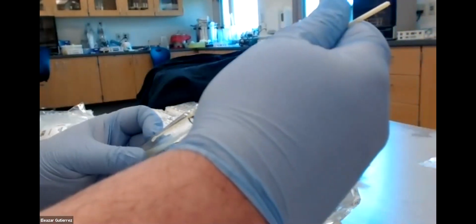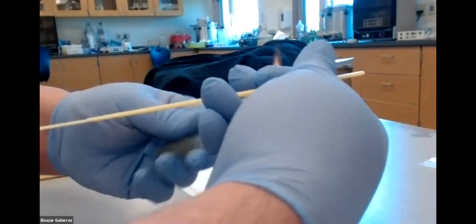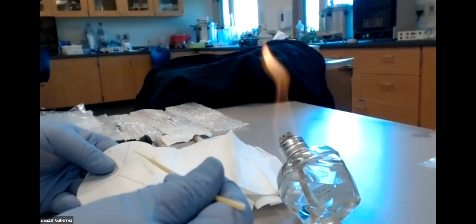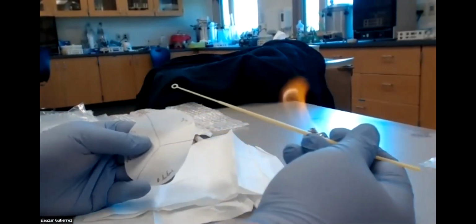Then I'm going to put my little loop in there, and you get a heavy inoculum. Okay. That looks really good. And flame it. Recap it. Okay. There's my E. coli. So I'm going to go to the E. coli area and put it on there. You guys see that? Trying to figure out where the center of my camera is at. Okay, we're going to put it right there.